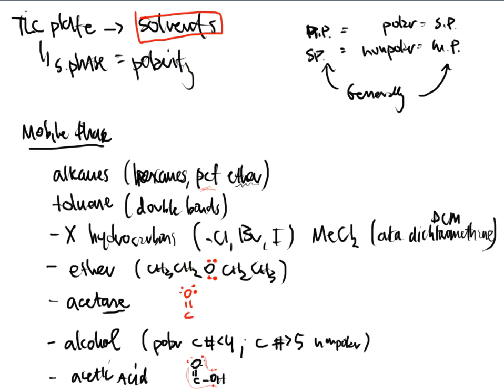So there's kind of a ranking of the mobile phases. And I'm not saying that you have to pick just one, because very often in the world of TLC, you can mix any or all of these together. And you can play with the polarity that will make your solvents suitable to separate the components that are in your sample that's been delivered to the laboratory.